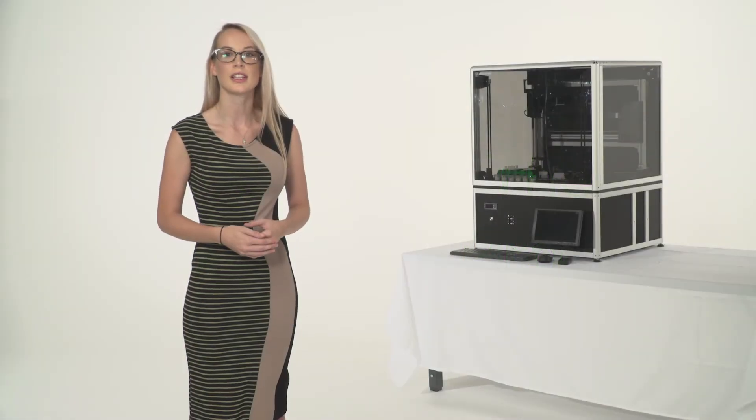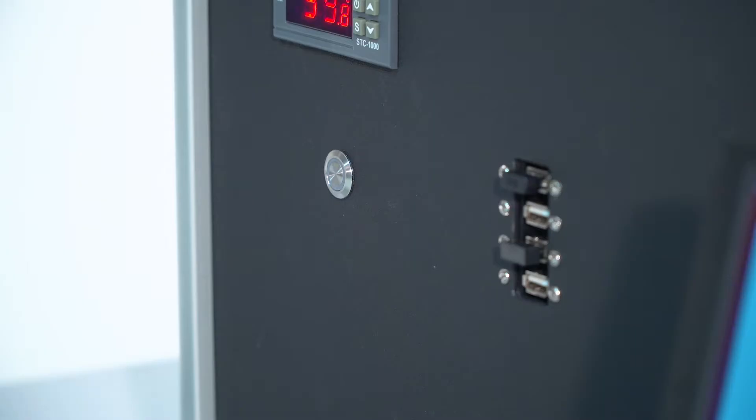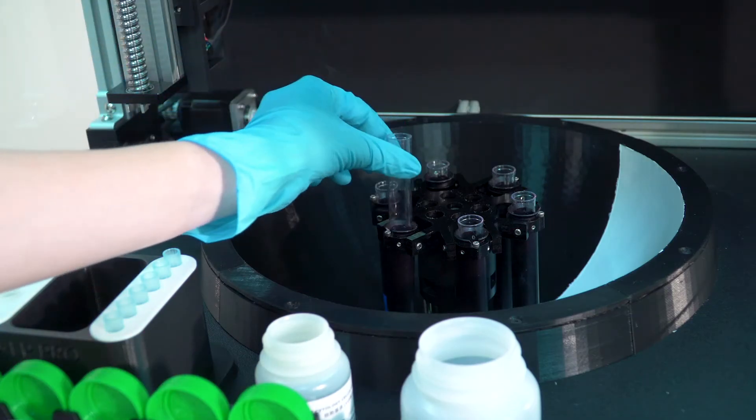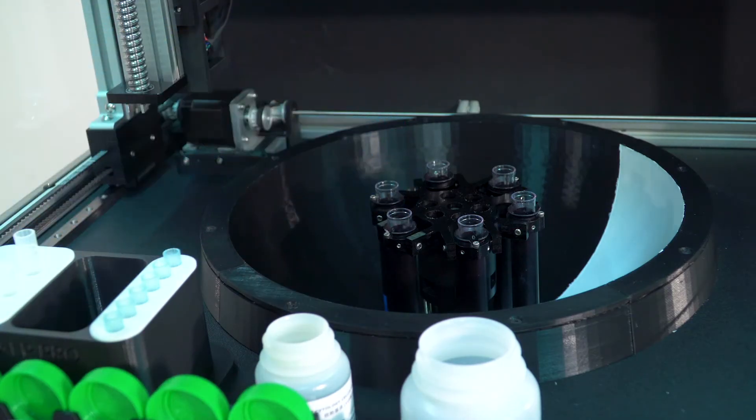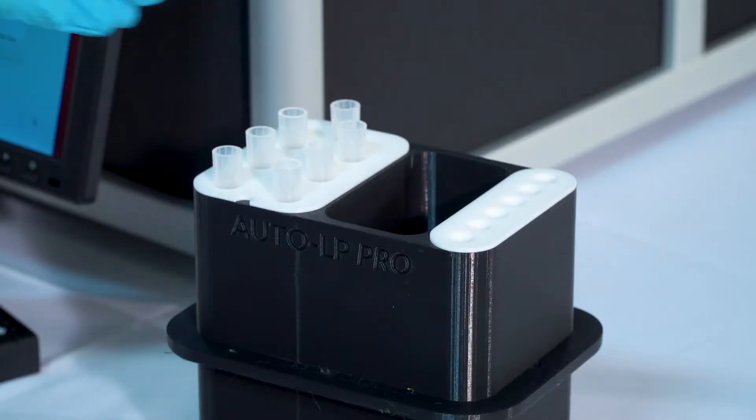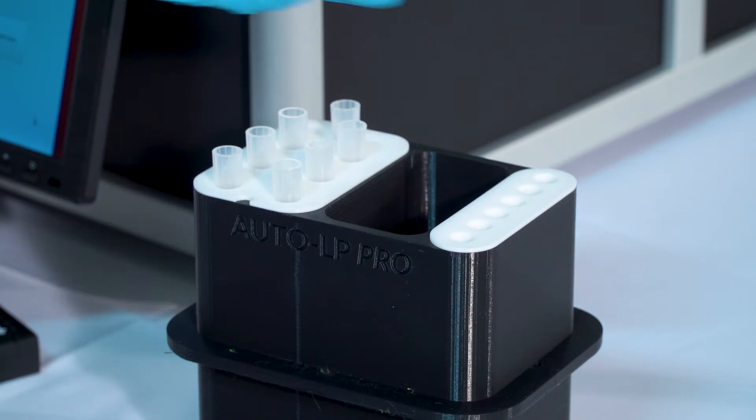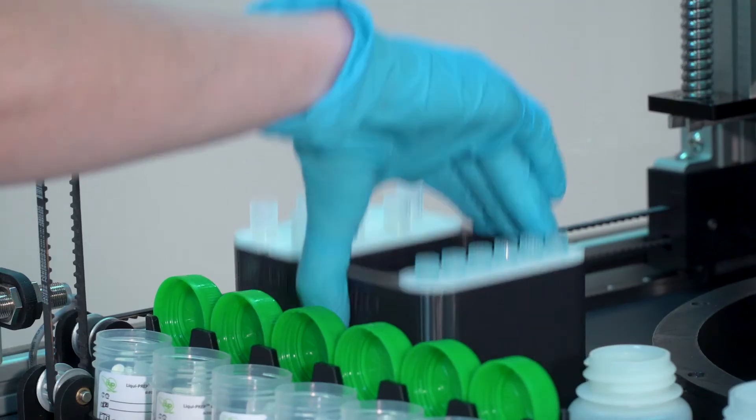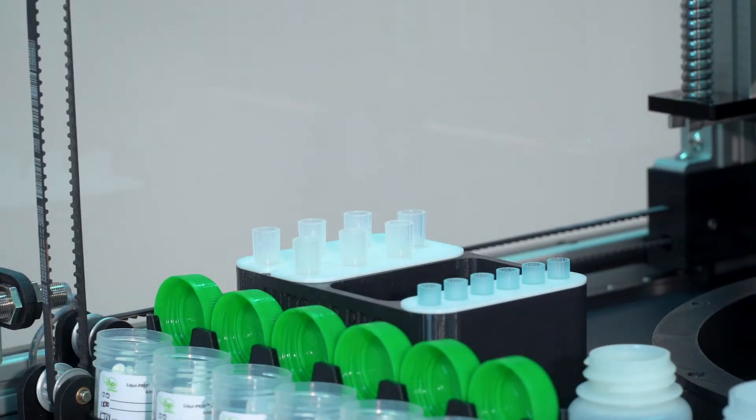Full cytology processing is simple and fast. Start by pressing the open door button. Place the centrifuge tubes and working tube into the AutoLP Pro centrifuge module. Place the 5 milliliter and 1 milliliter pipettes into the pipette tip and waste container, then place the container into the AutoLP Pro.